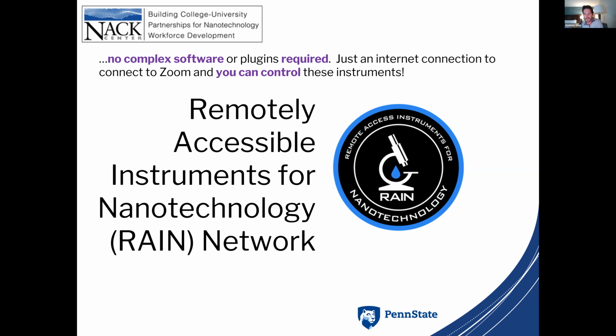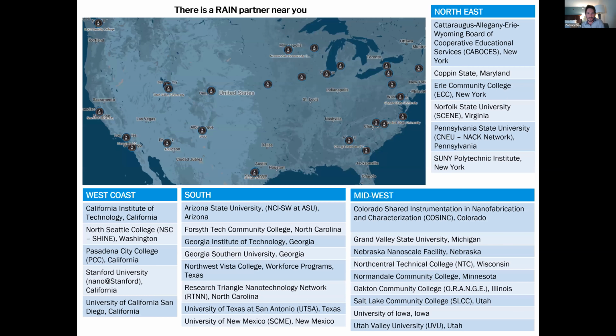They can be the ones zooming in on the sample. They can be the ones taking the pictures. And that's really where a lot of the learning happens, is when your hands are the ones controlling the machine. This is a list of all of the network nodes; every little black dot in this image represents a node, so anywhere you see one. So right now, obviously, Lauren is sitting in, I believe, San Diego, and she's going to be the one helping us out here in a few minutes. But these are all over the place. So if your high school is located, for example, somewhere here in Texas, you can have your students rip out one of their hairs or something, or find an ant on the street, put it in an envelope, send it to Texas, and then they put your ant in the microscope and you look at it.